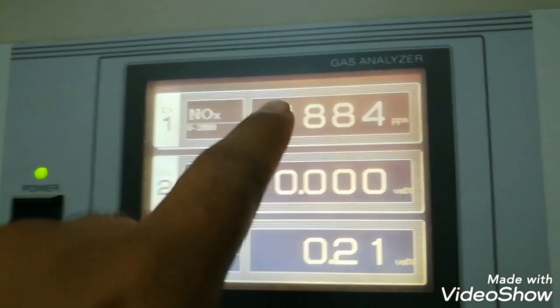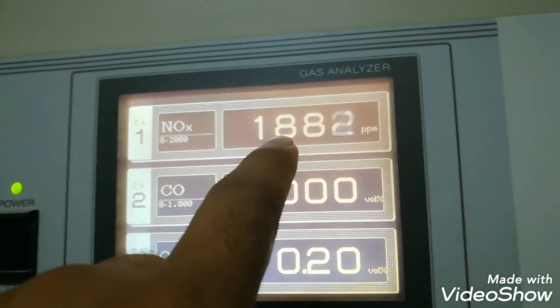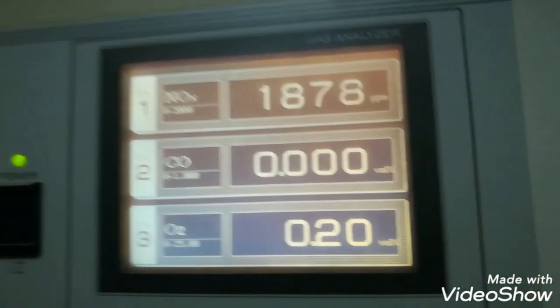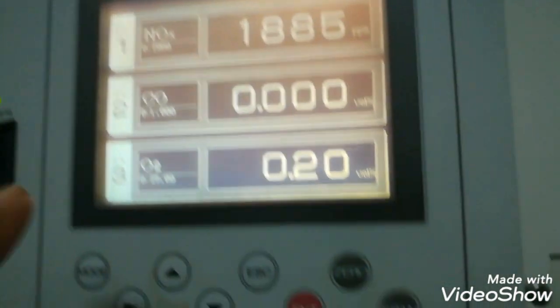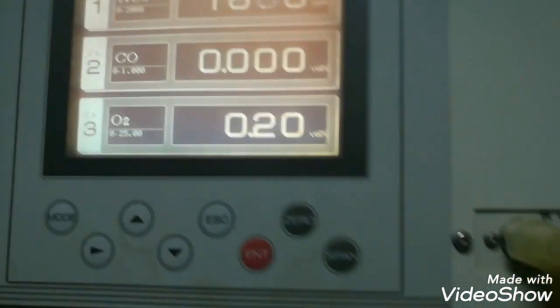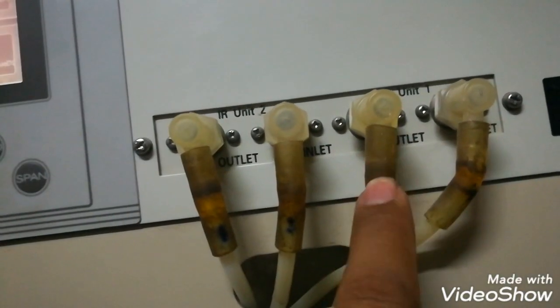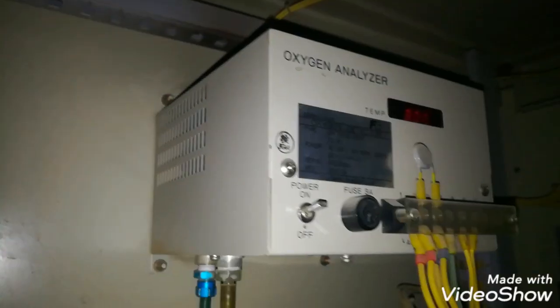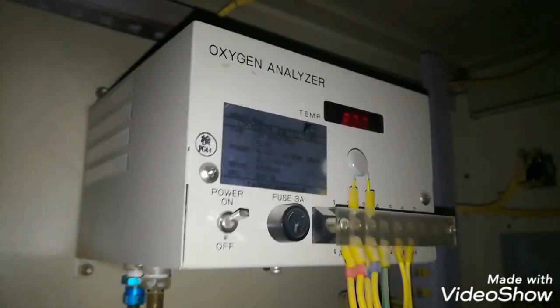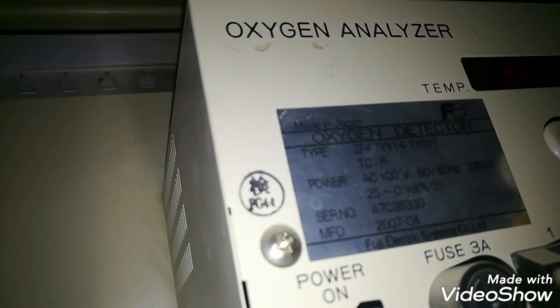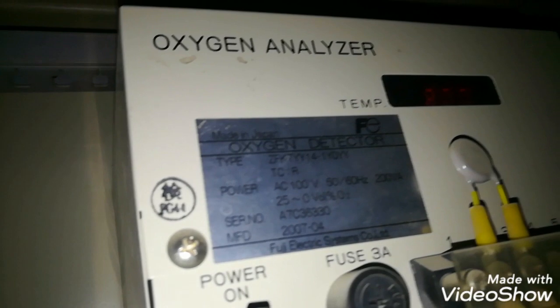You can see NOx and then CO measurement. And then oxygen — for oxygen we are using a separate module. Unit 1 out goes to the oxygen module. Here is the oxygen analyzer, which is a separate module. Its power is also 110V AC, as Fuji uses 110V AC.